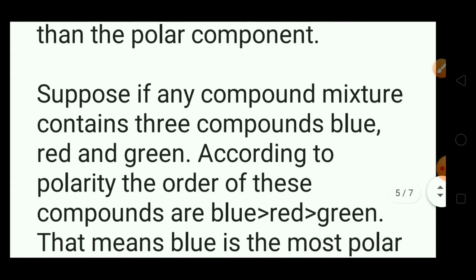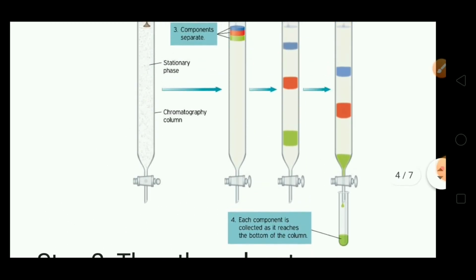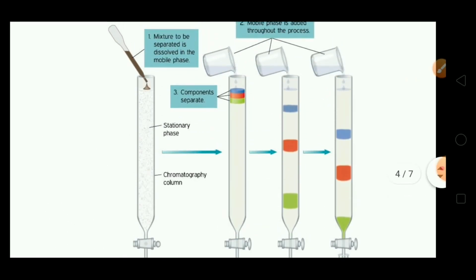Suppose any compound mixture contains three compounds: blue, red and green. You can see three components separate: blue, red and green.